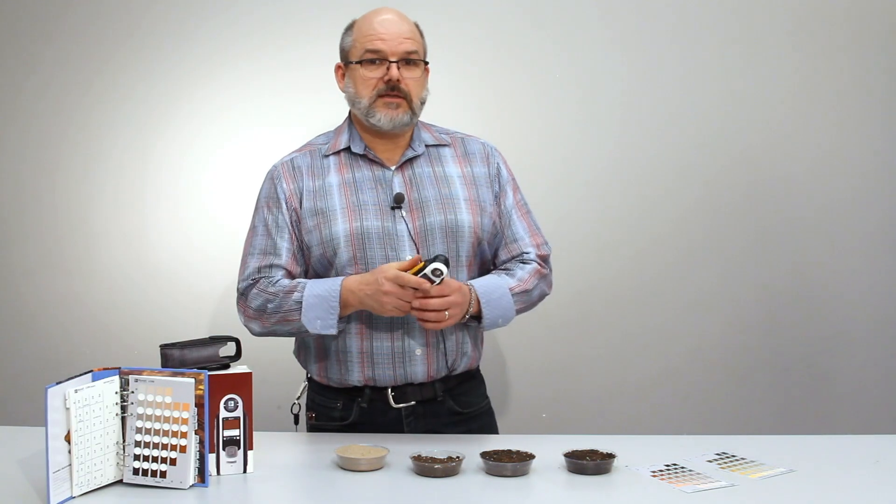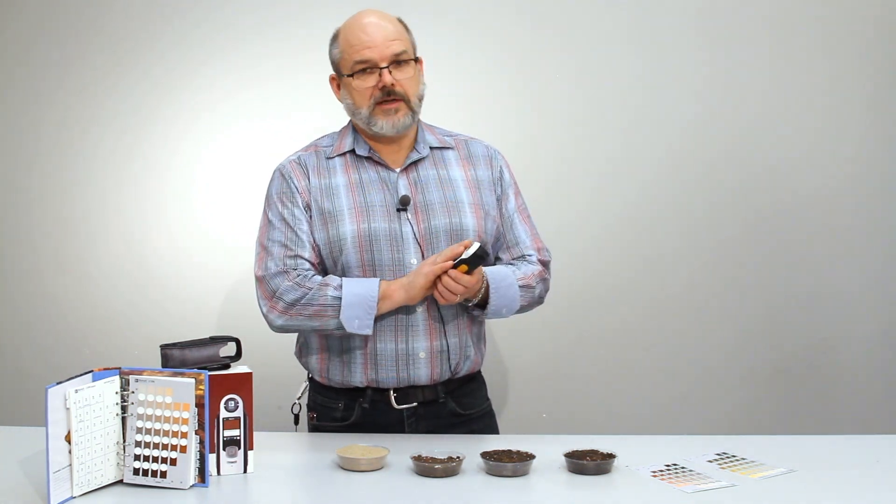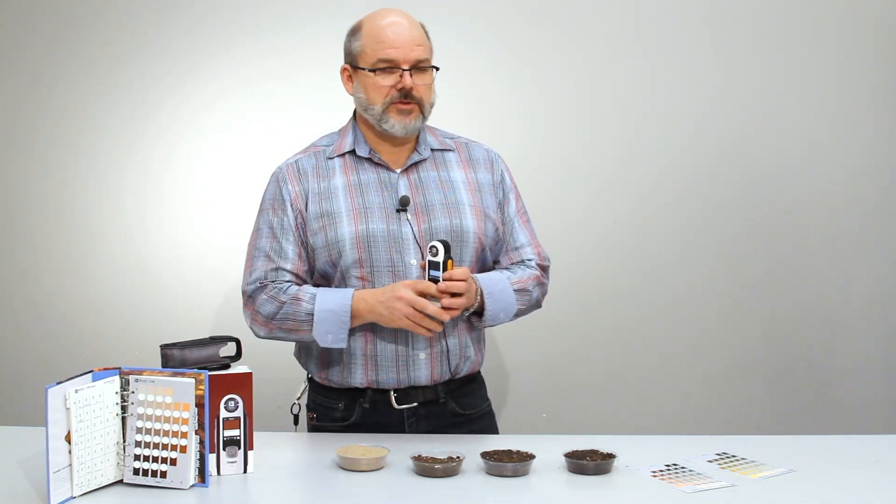The device is very quick and easy, it's portable, and allows you to go out and take your measurements. There is software that comes with it where you can download your readings to.